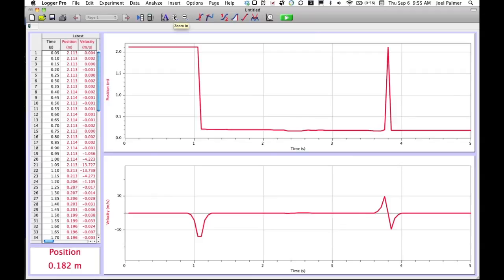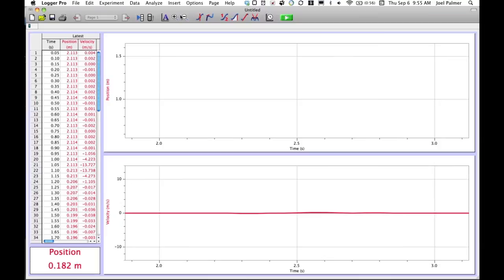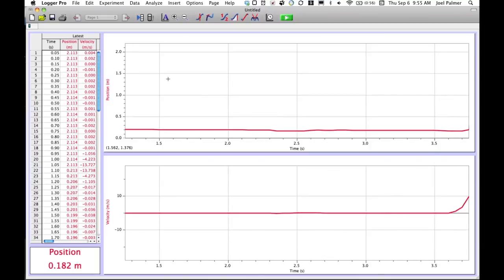The plus is a zoom in, and it's very similar to a magnifying glass in most programs — you zoom in or zoom out. The next set of icons you're not going to use a whole lot in middle school — these are statistical analysis tools. They allow you to find the tangent to a curve, find the best fit line, do statistical analysis of your curves, and find the area under the graph. These are more sophisticated tools used in high school physics classes.